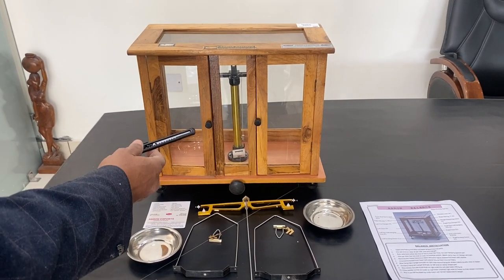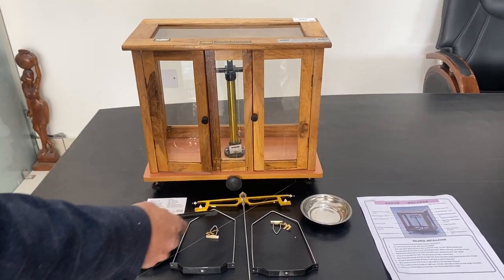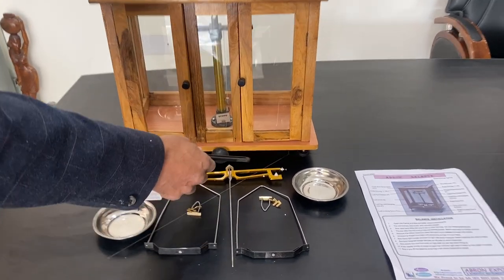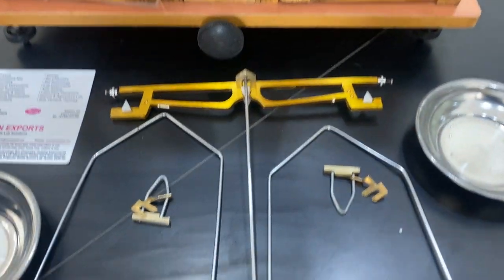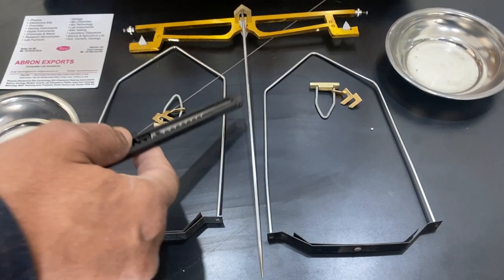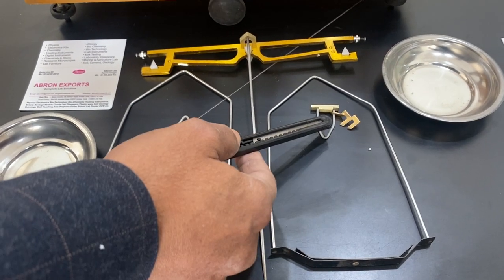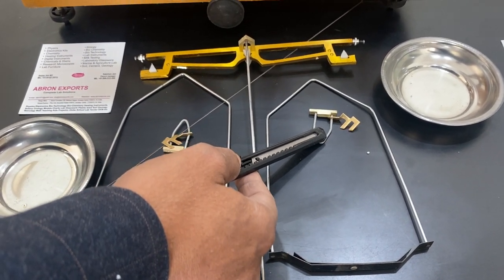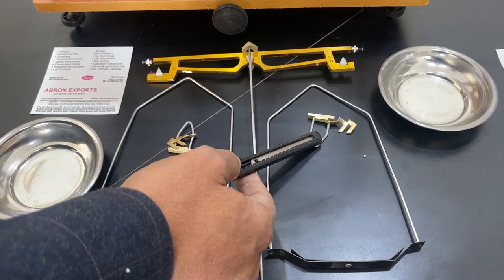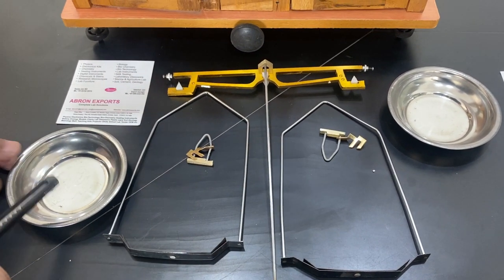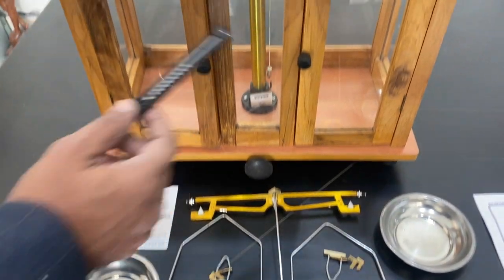This is a physical balance with one beam, one needle, two side wire pan holders, two hanging parts, and two pans. It comes with a wooden box.